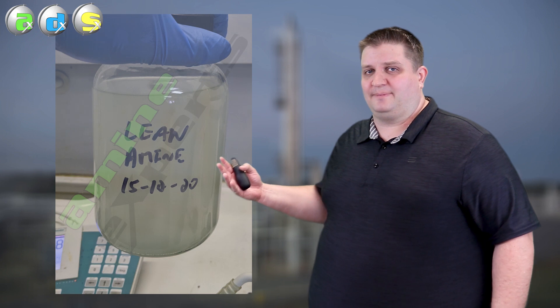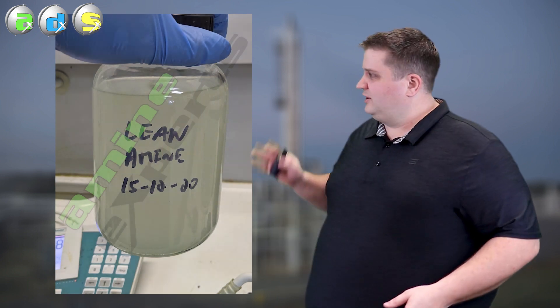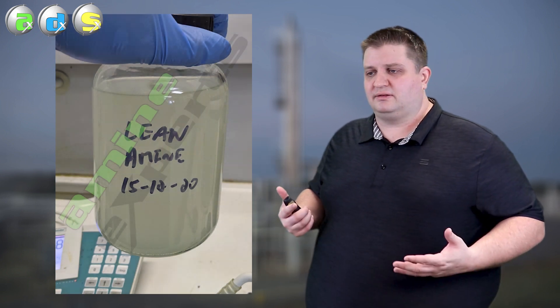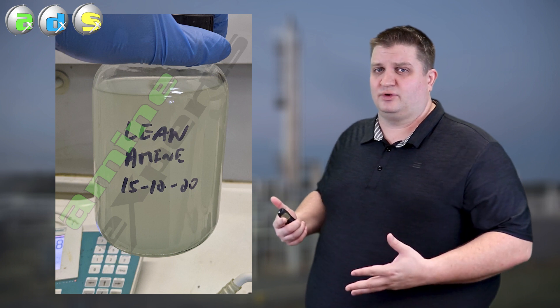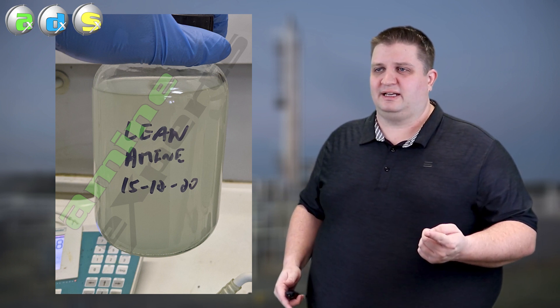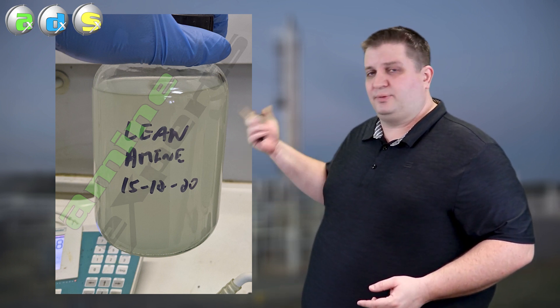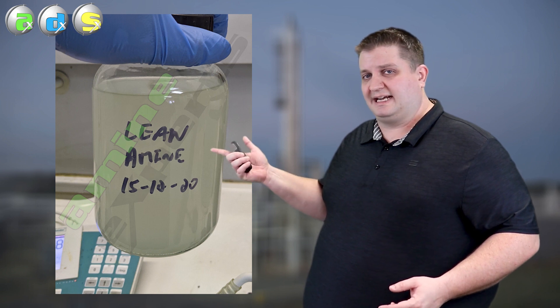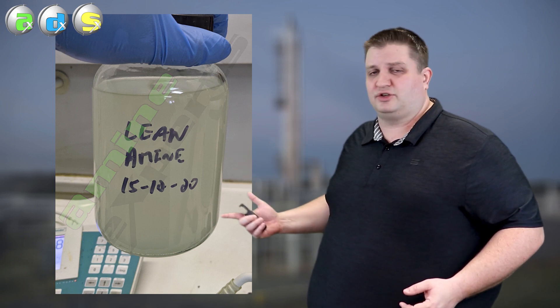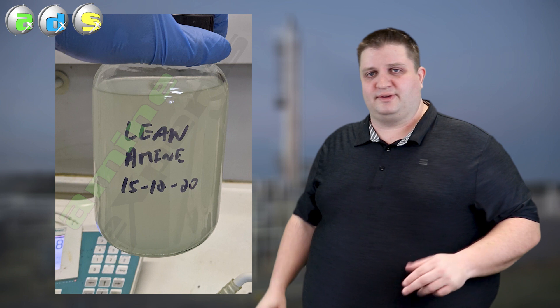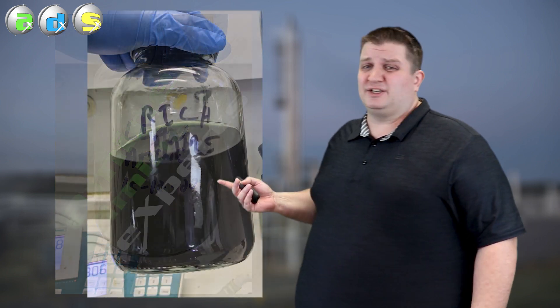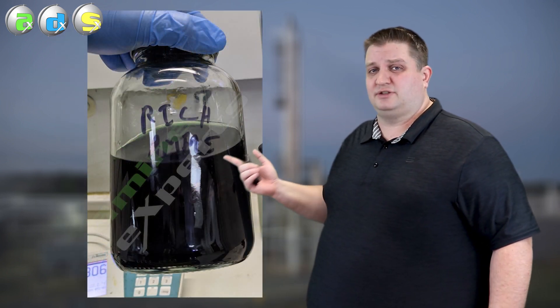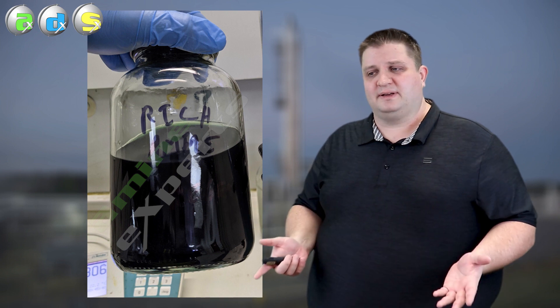So now you've pulled yourself a nice clean sample. Everything looks good. You're really happy with the results you got. Well does that mean everything's fine and you're ready to rock? Well no not necessarily. We're going to take a case here where we pulled this sample from a system, the lean sample. Everything looked happy. Everything looked good. The amine strength came out nice. We were pretty happy with that. But then we took a rich sample and you got this ugly dark green thing. Well what happened?